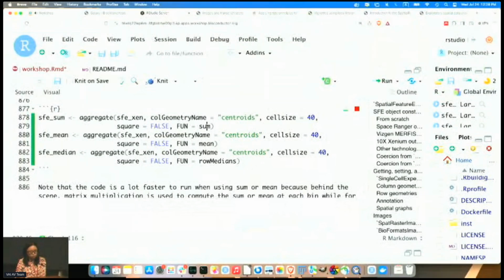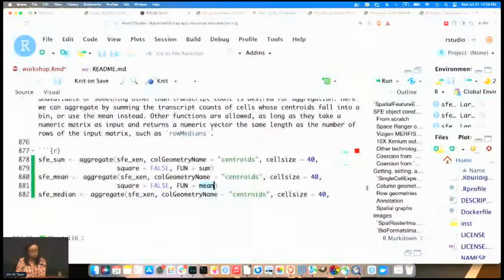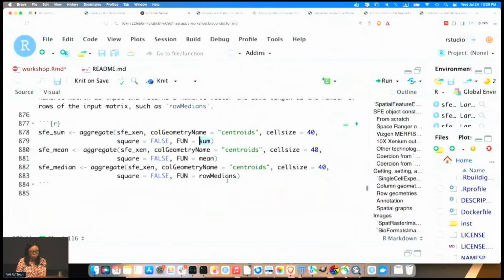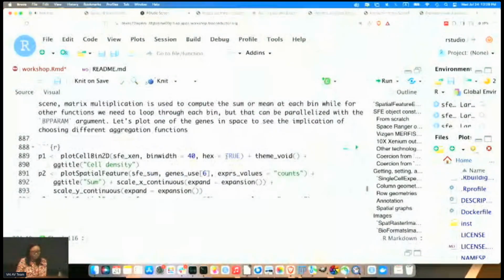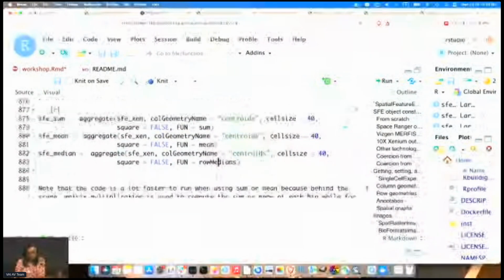Behind the scenes, I'm using matrix multiplication to compute the sum and mean. For the other functions, I have to loop through each individual spatial bin. That can be parallelized, but it's still slower than matrix multiplication. Here I got sum, mean, and the median.